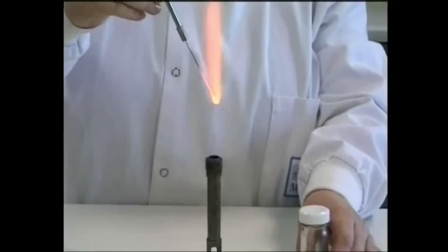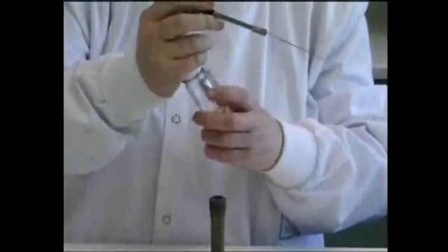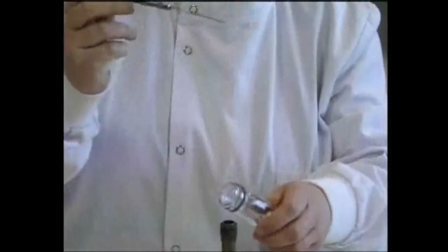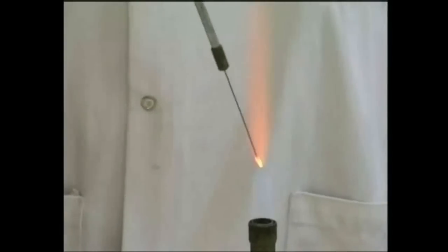Flaming is simply heating equipment in a Bunsen flame. Loops, wires, spreaders, and pipettes are all flamed in order to sterilize them, but a different technique is used for each.